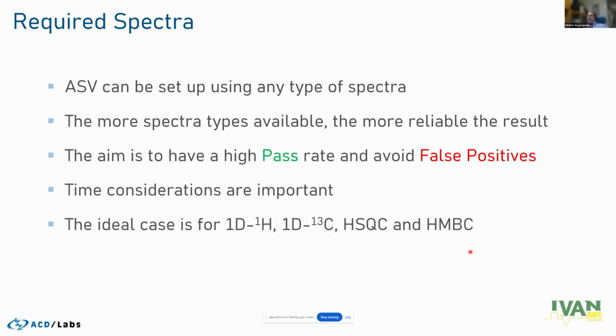So if you need half an hour per sample, then you can only do 48 samples per day. Well, if you have 100 chemists, that's a problem. Now, if you add a 1D carbon, which may take 1 hour, you can reduce the numbers even more. So we have to be a little bit pragmatic about what's happening. And I believe that our speakers will touch on this.